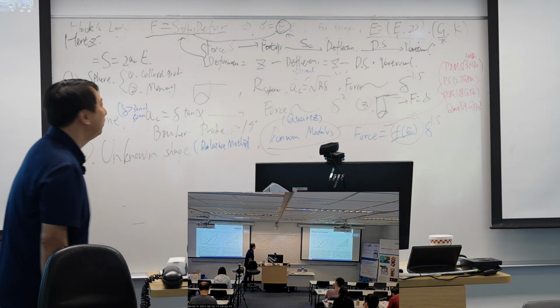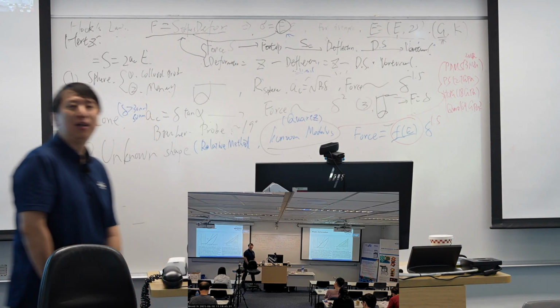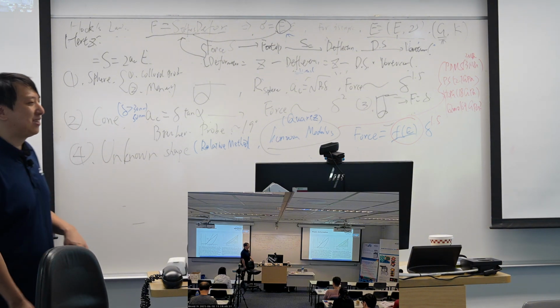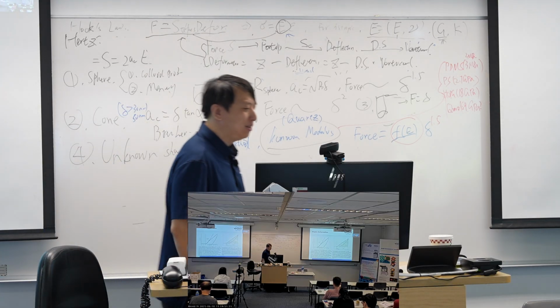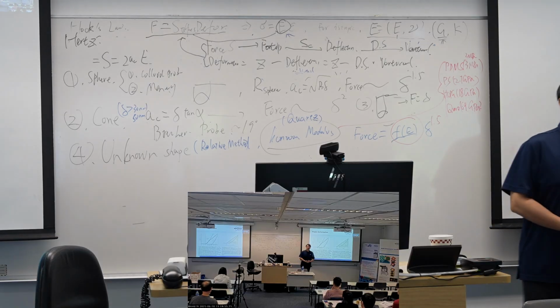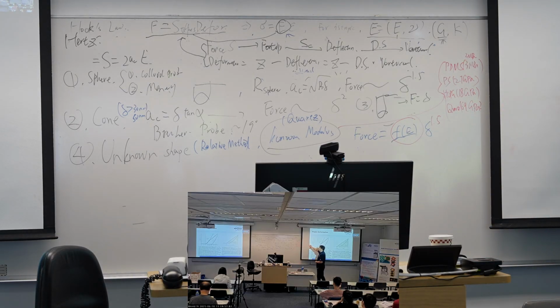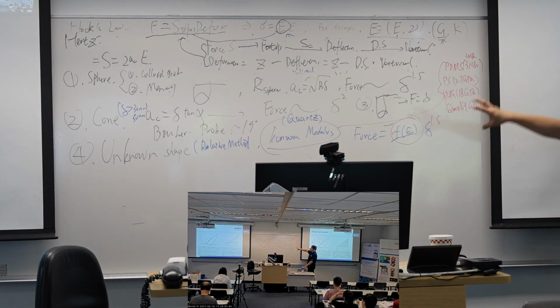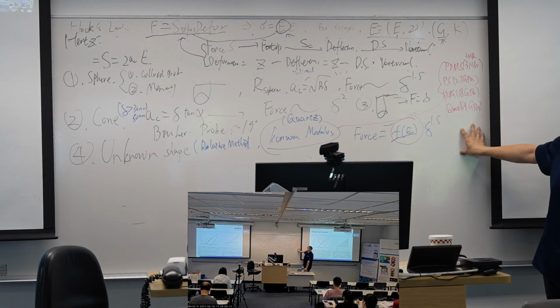Okay, so that's about the basic concept of the AFM nanomechanics. And I think in the afternoon we will do some hands-on sessions. We will show you the calibration stuff. We will show you the capture of force curve and transfer the force curve into stiffness.